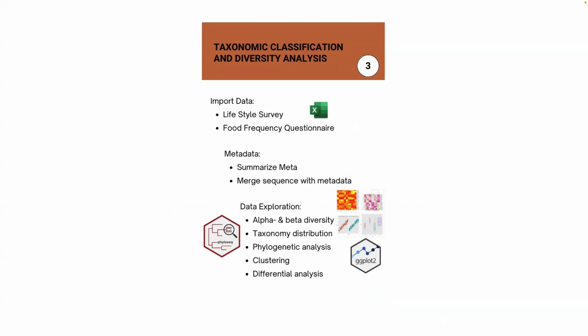We will start by importing metadata collected through participant surveys. These surveys contain information such as dietary intake, physical activity, and demographic details like age, sex, and weight. Once we have reviewed the metadata, we will use a package called PhyloSeq to analyze our microbial ecology. We will classify the microbiome and explore diversity, determining how different dietary and lifestyle factors play a role.